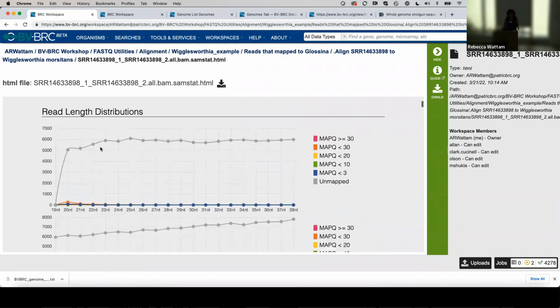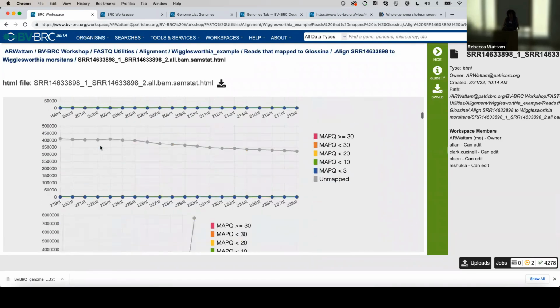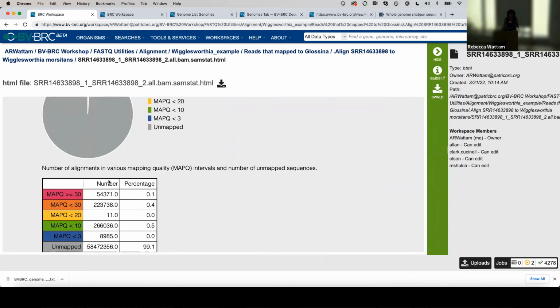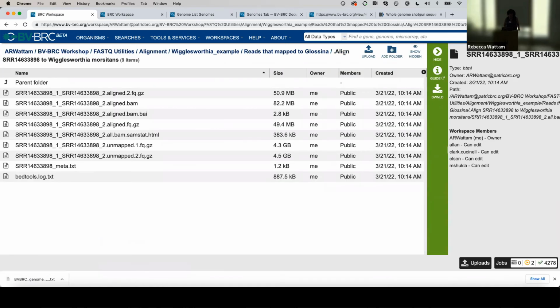And okay, and this report goes on and on and on and on. I never look at all this stuff. It goes on forever. I just look at it for that cute little circle that pops up to show you that. And then trust me, because I've done a lot of trying to game this system, because my goal is always to get the best genome I can for my analysis. So for this particular one, which is an endosymbiont that's very small, these are enough reads to get you a pretty good genome.